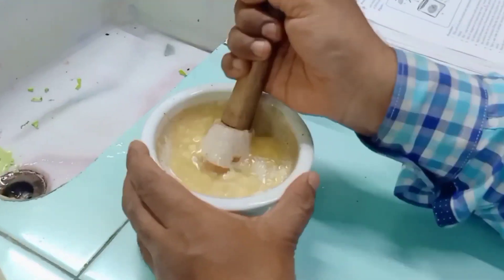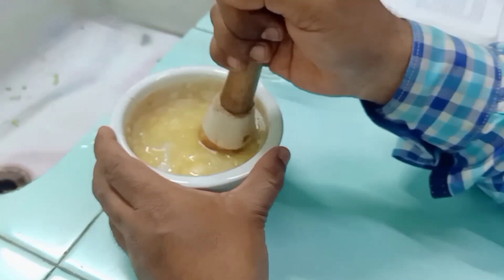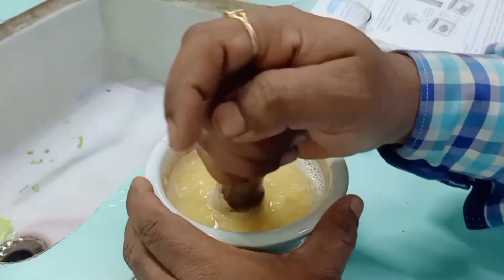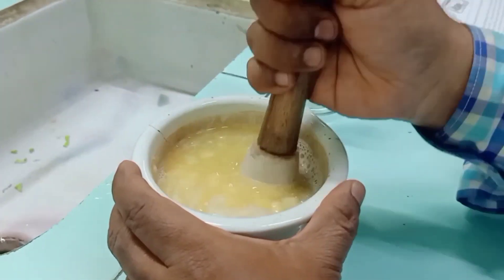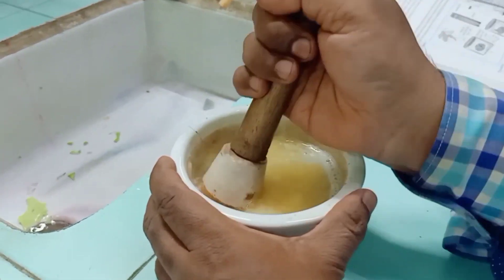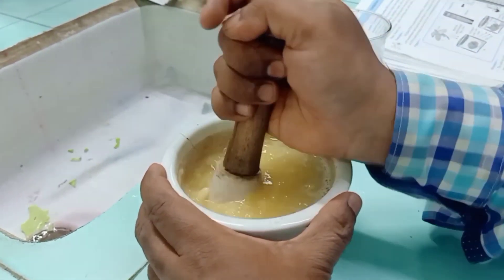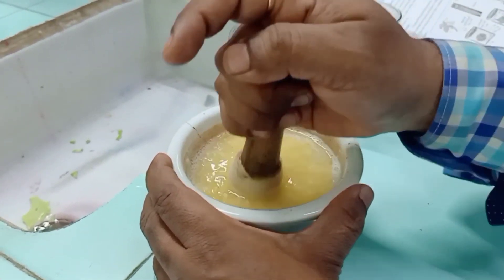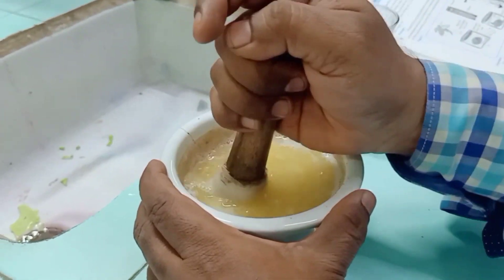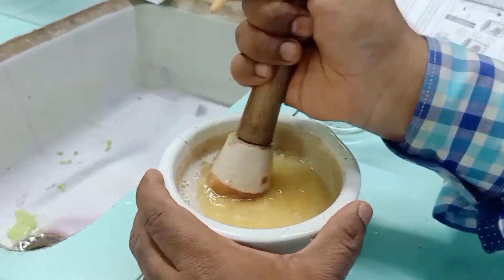The salt — the hypertonic solution — helps bring the DNA together, while the detergent water lyses the cell so that the DNA is released from the nucleus. We keep on crushing and grinding so the cells get lysed easily, as the reaction takes some time.